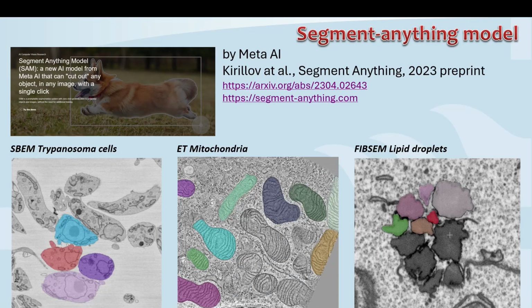Hey, hello everyone. Welcome to this new video about Microscopy Image Browser. And in this video I'd like to talk about application of the Segment Anything model and how to install and how to use it in Microscopy Image Browser.